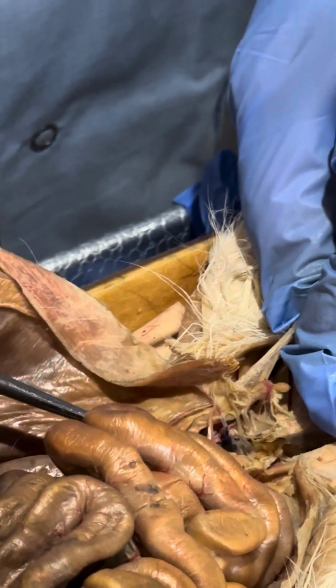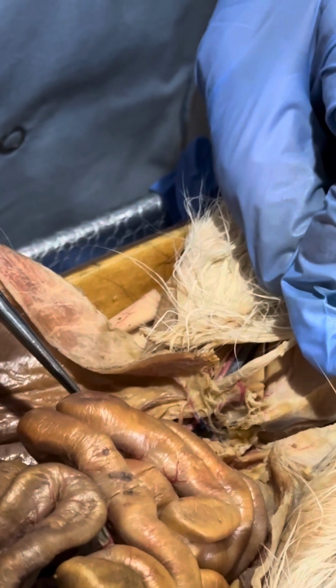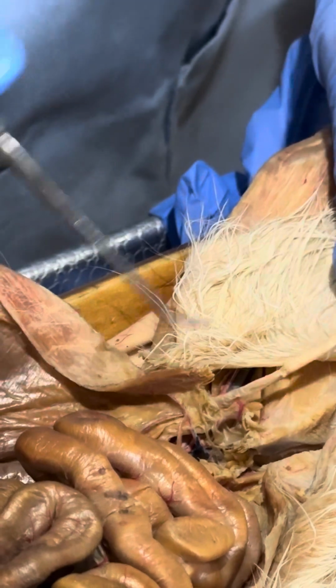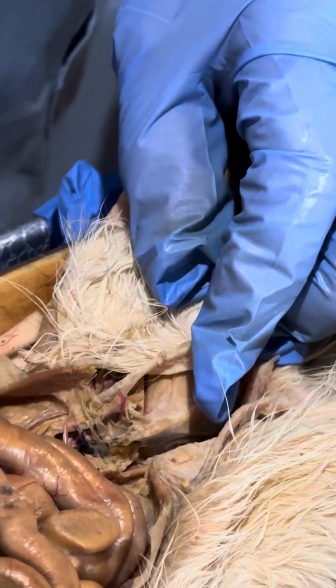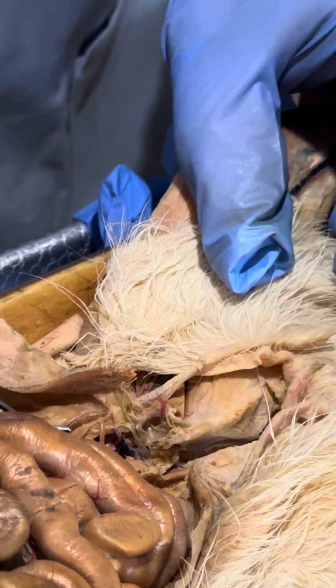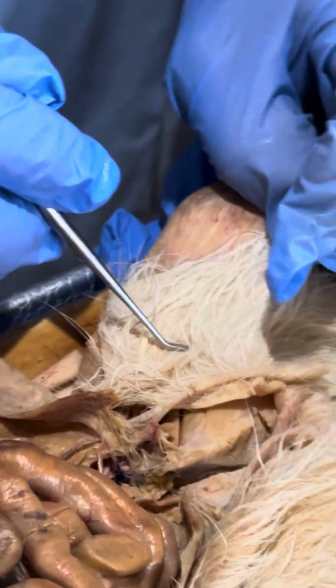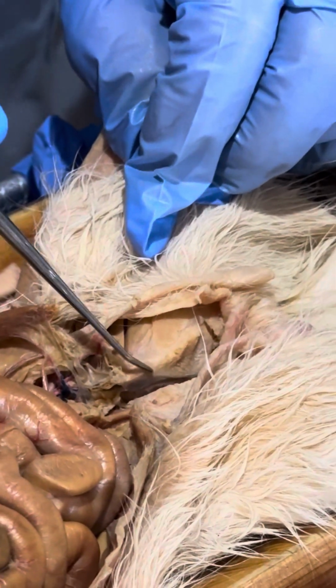So the vas deferens descends down on the posterior side of the urinary bladder and then becomes the ejaculatory duct. We'll talk about that again. I can't show you those things in the cat, but I can tag the testicle, the spermatic cord, and vas deferens. And I don't think the arteries are on this practical. I think they were in the earlier practical. This penis, however, comes through the pelvis.